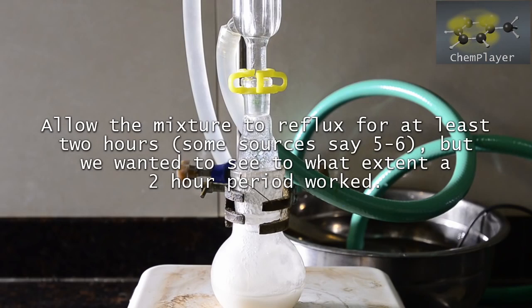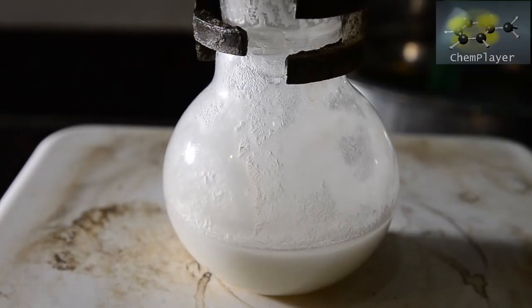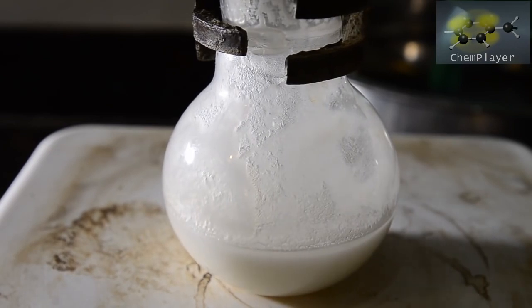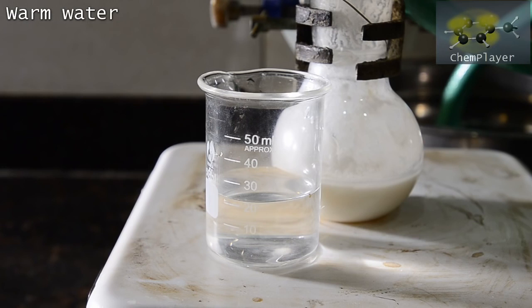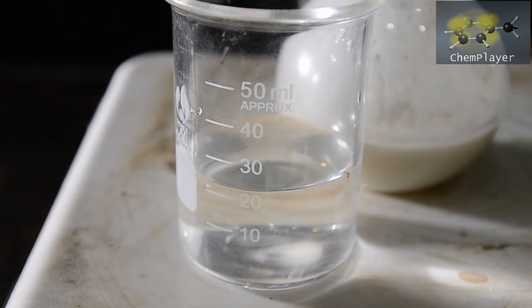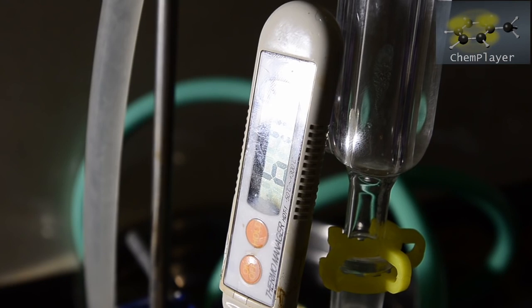There wasn't any further visible change to the reaction mixture during this time. It's still a relatively liquid slurry. During the last 15 minutes we prepared a beaker containing 20 ml of water, and placed this on the hot plate. When the temperature of the water is about 60 degrees C, then it's ready.